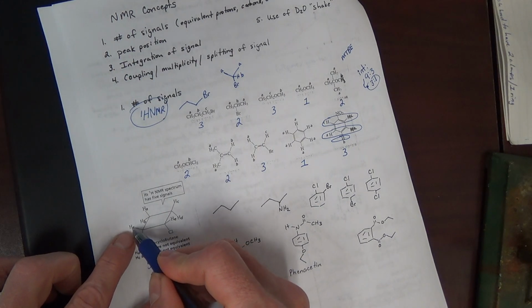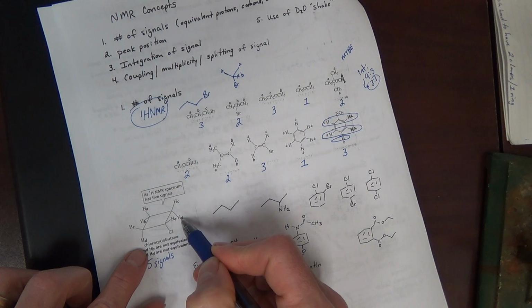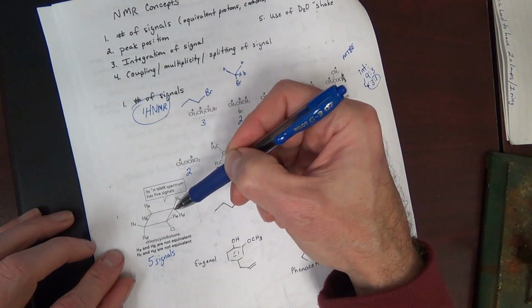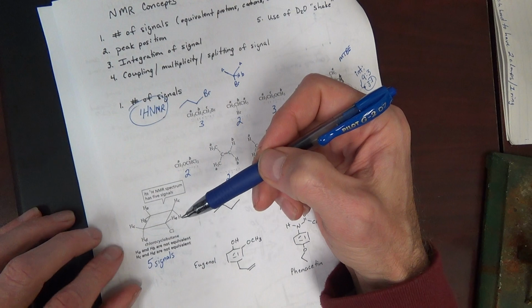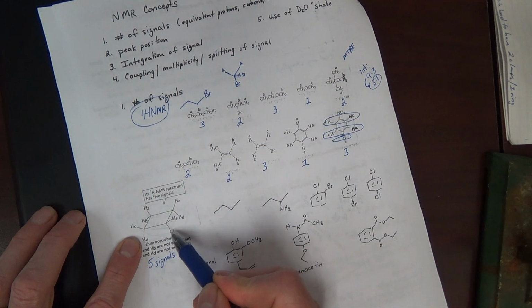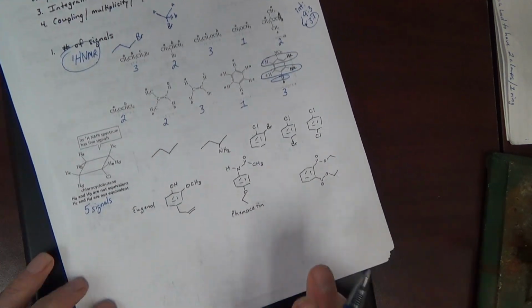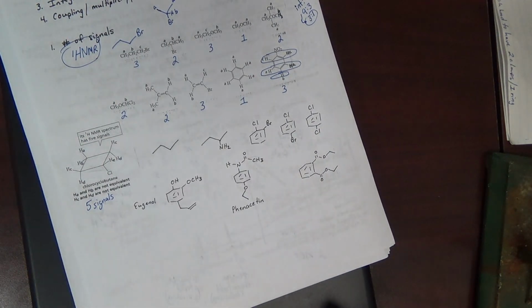Over here the same thing, but these two H's are the same. Those are both HC, these are both HD. And then these two are different because they're on a different carbon, and it's not the same as that, because this carbon's bonded to the carbon with the chlorine, but that carbon's not. And HA is trans to the chlorine, where HB is cis to the chlorine. So 5 signals. Give these a try here on your own, and we'll look at those in class.